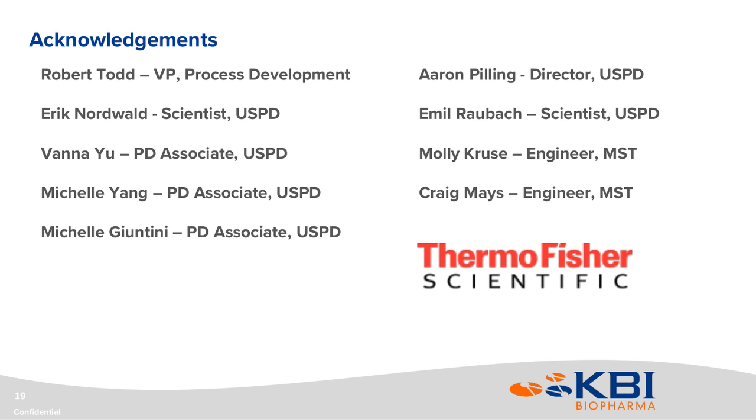As I mentioned, all the operations around a stainless system, in terms of empty vessel sterilization, full vessel media sterilization, cleaning, things like that, we get to take most of that out. And as I mentioned, one of the challenges of the supply chain is that our run rate has increased so much. It's a new model to get used to, keeping those consumables and bags stocked.